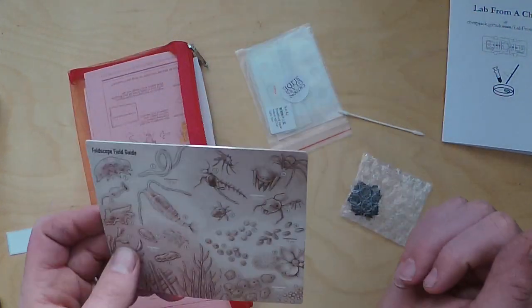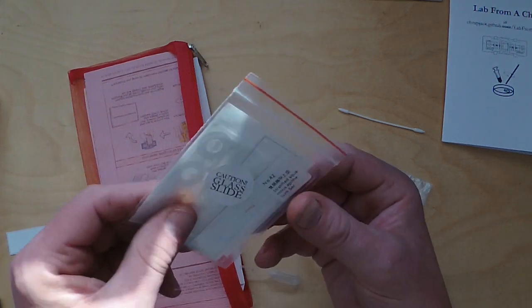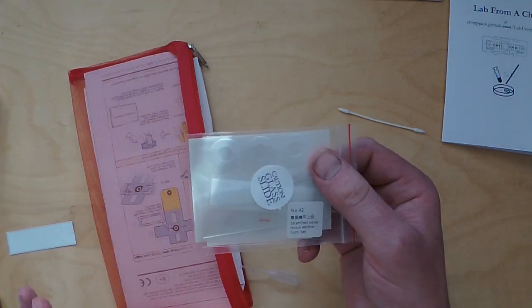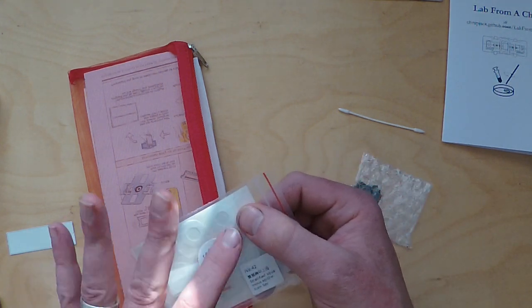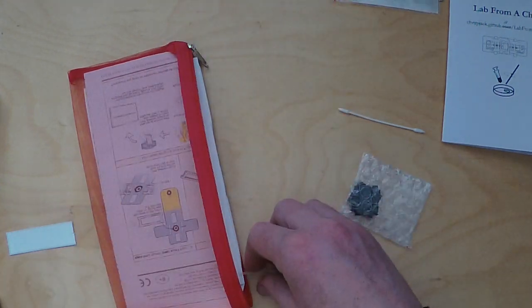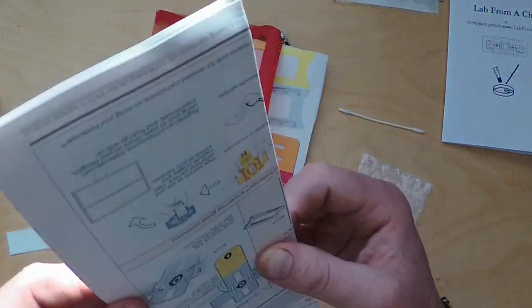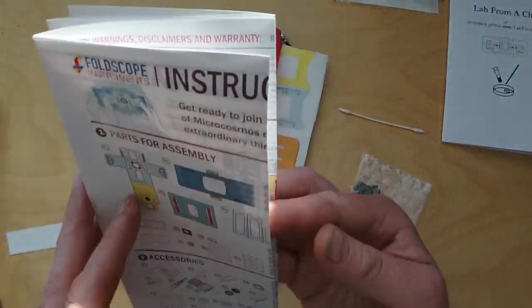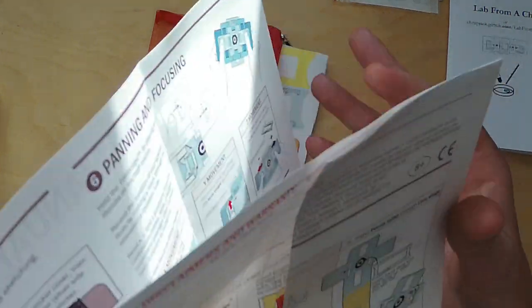So just take those out for now. You'll also see some stickers here. These are important for attaching the microscope to your phone so you can capture images and share them with the group. There are also sticker cover slips for slide preparation - we'll go back to those later. So the main thing is the instruction booklet, which is a fold-out double-sided set of instructions. You want to start the assembly instructions on this side and we'll work through them together in this video.